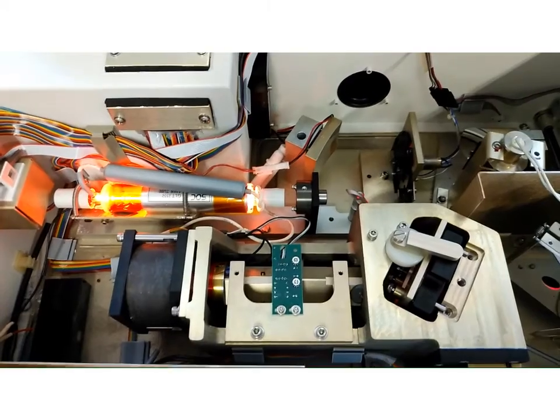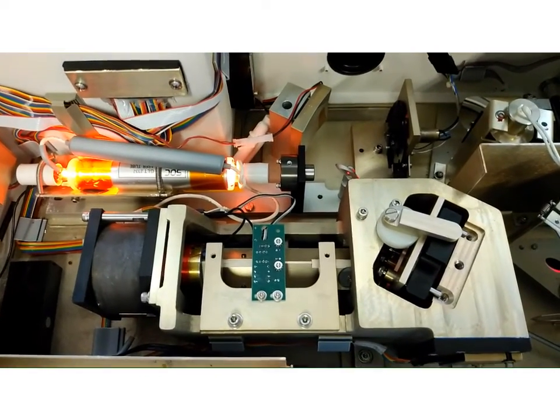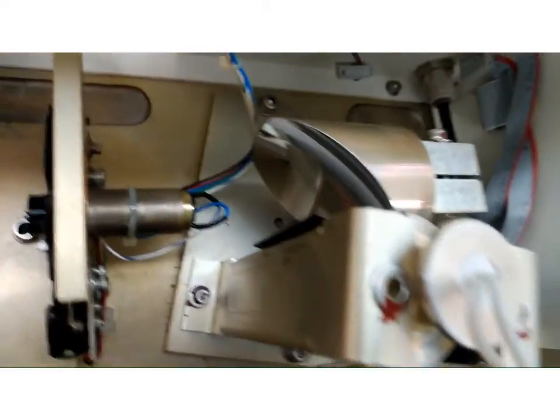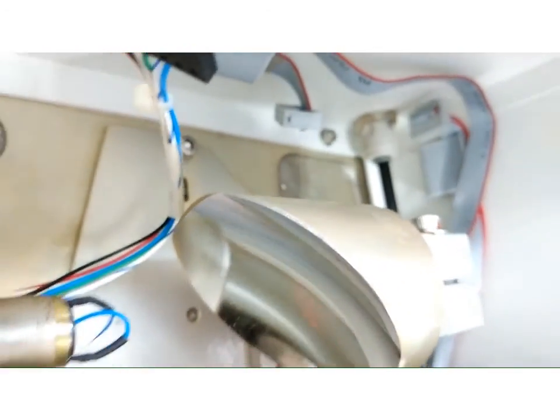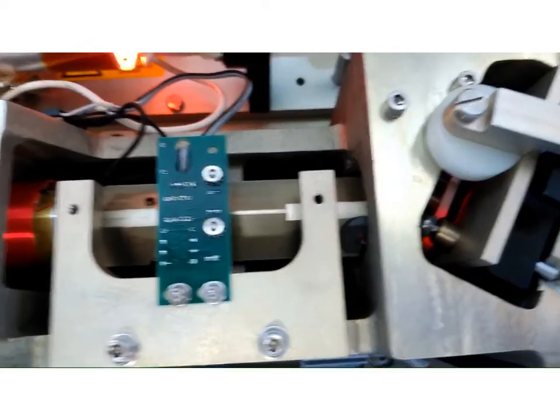This is an interferometer. Here is the light source. The light source cannot be seen from this position, but the light emitted from the light source is reflected by this mirror and passes through this hole. You can see the light from the light source when you insert the camera. Then it is reflected by this mirror and enters the interferometer.